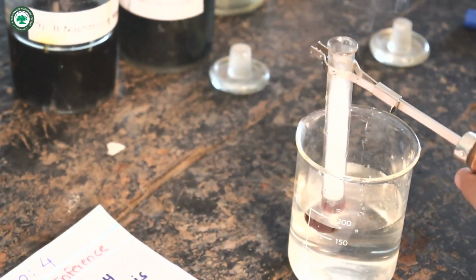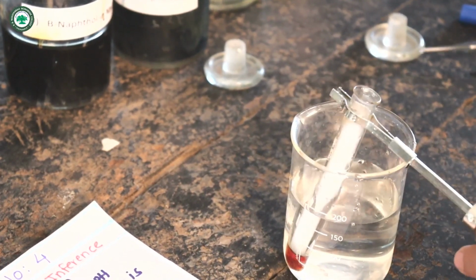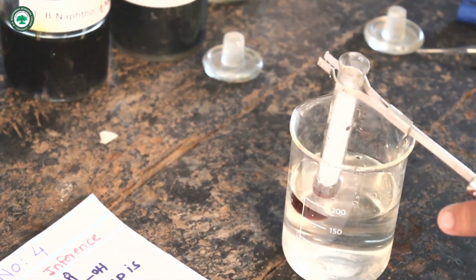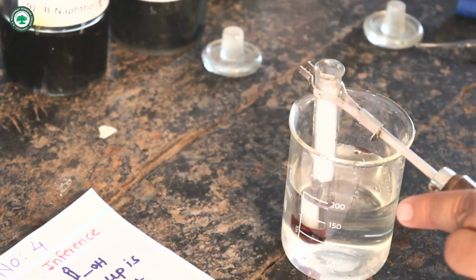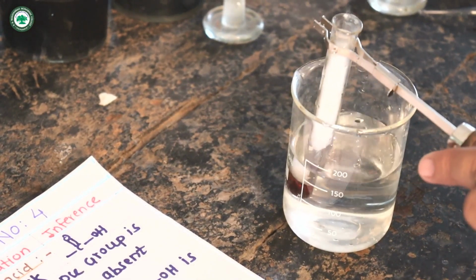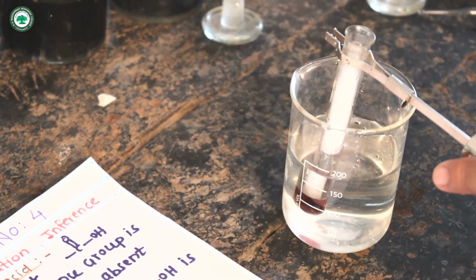Then cool test tube first under tap water in a beaker. Cool for 1 to 2 minutes.